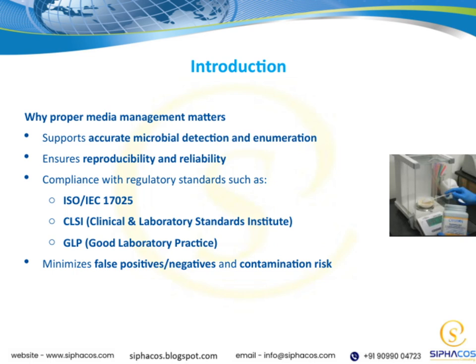For example, standards like ISO IEC 17025, CLSI guidelines, and Good Laboratory Practice, or GLP, all emphasize proper media management. Following these standards helps us meet regulatory requirements and maintain credibility. Finally, good media management minimizes the risk of false positives or negatives, which can lead to incorrect conclusions. It also reduces contamination risks that could compromise our entire experiment. So, overall, proper media management is vital for producing accurate, reliable, and compliant microbiological data.